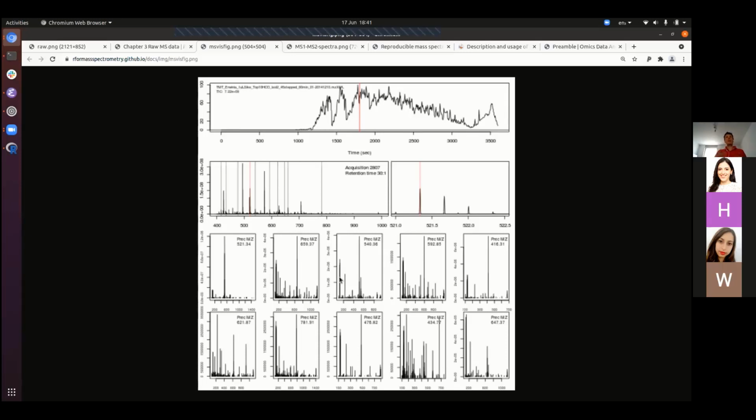And so the mass spectrometer quickly acquires MS1 scans, and then it sees, oh, here's an intense peak. This is interesting, so I'm going to get rid of everything else, select it, fragment it, acquire an MS2 scan, and then carry on with another MS1 scan and say, oh, this one is still intense. And it's going to do that in a continuous way.